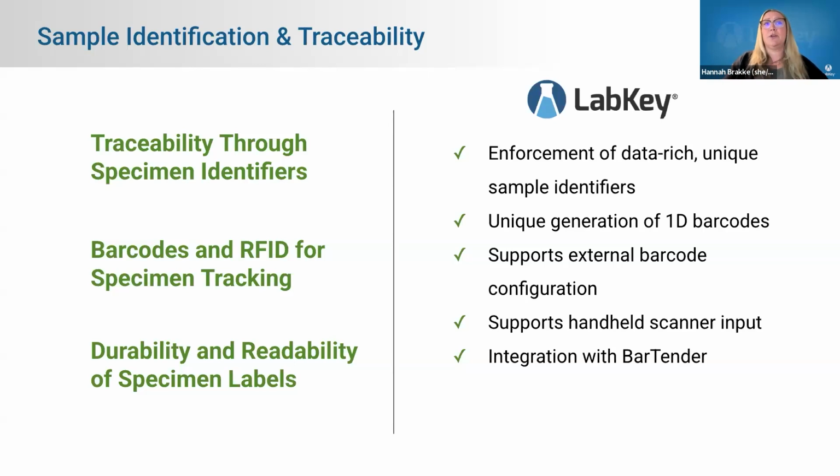And then around the durability and readability of these specimen labels, one of the things LabKey software can also help support is input from handheld scanners, as well as an integration with BarTender, which is a leading label design and printing tool that's very printer agnostic.